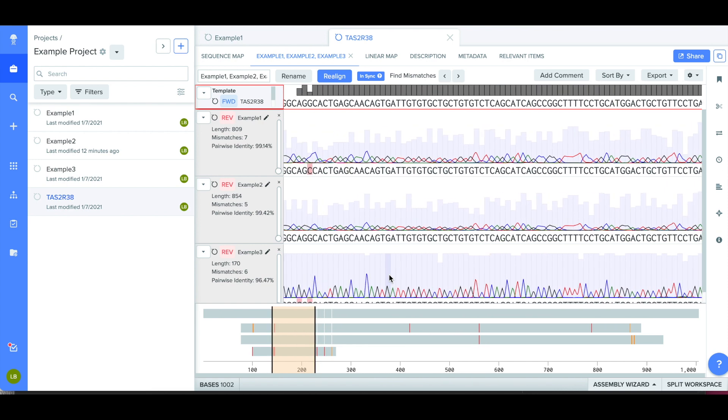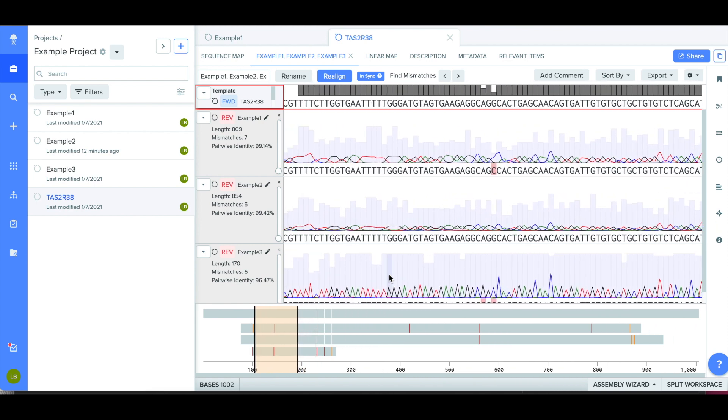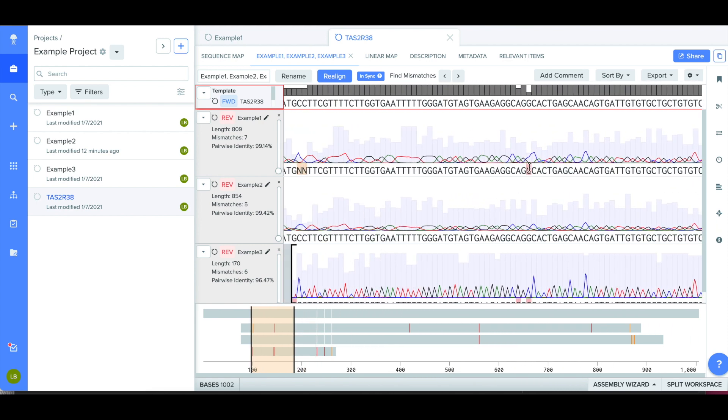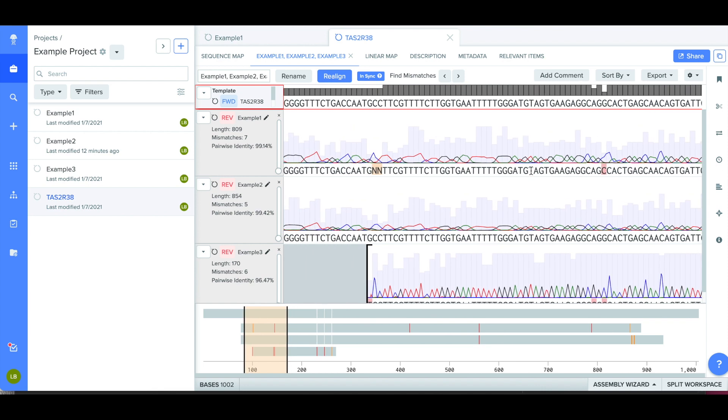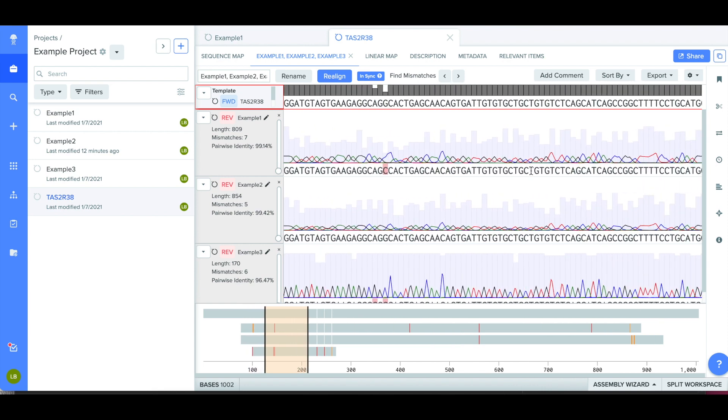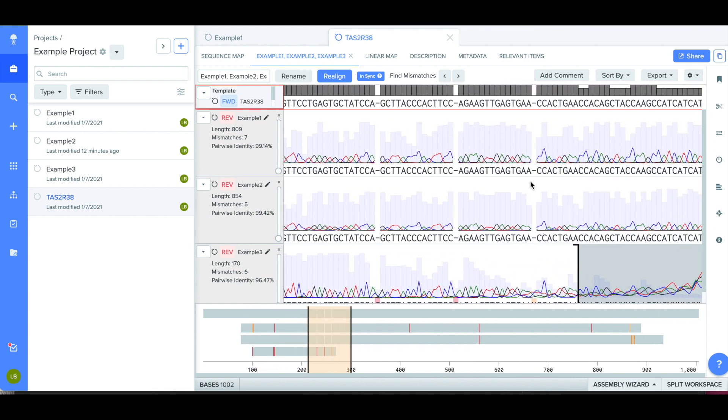If the software detects any differences between the sequences, they'll be highlighted in red. These are areas where the sequences have different base pairs at that location.